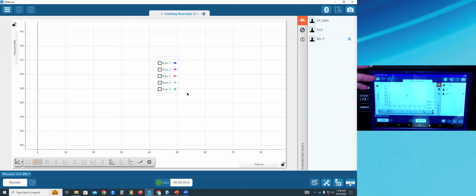And oh, look, I have control. There's a dot moving on your screen. I've got control over your SPARKvue, but you're looking at what I'm looking at, right? So if I want to, I could kick out anybody that doesn't belong there. If I need to do that, I can. But here's what happens if you are sharing your screen. So I'm going to switch away from my screen since you may or may not have one to look at.